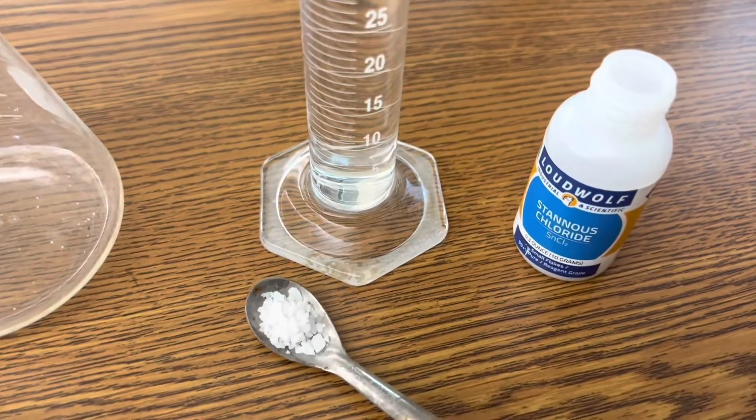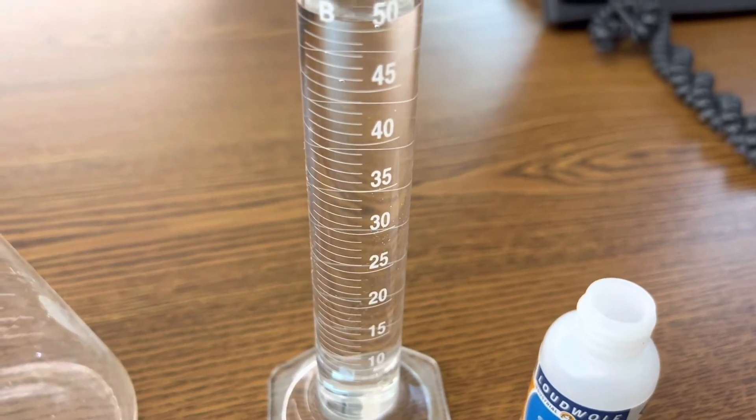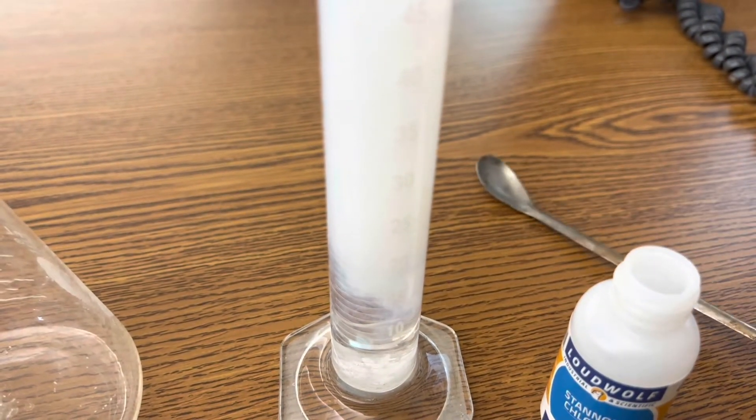The first step is to create an aqueous solution of stannous chloride by adding 8 grams of stannous chloride to 50 milliliters of distilled water. It'll get really cloudy like that, and you're just going to stir it in before putting it through your filter.